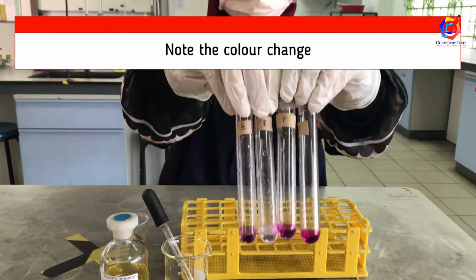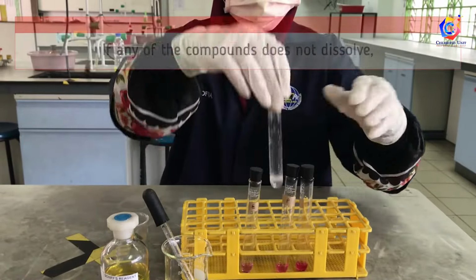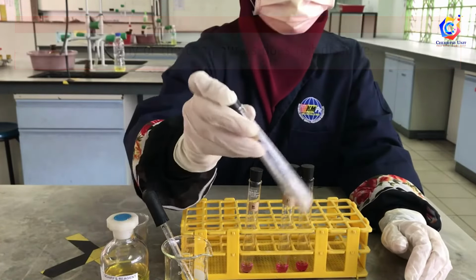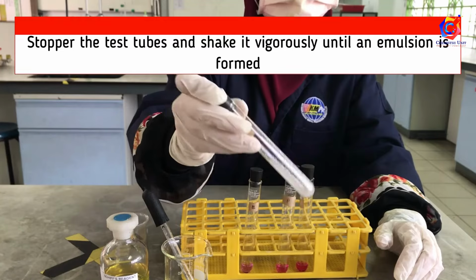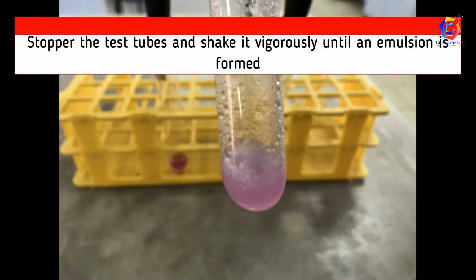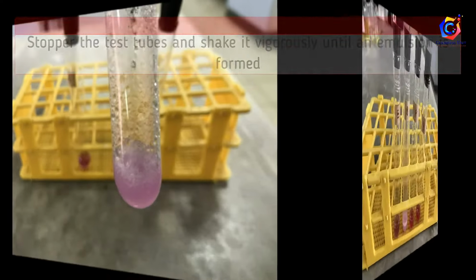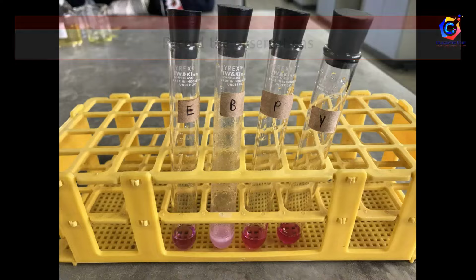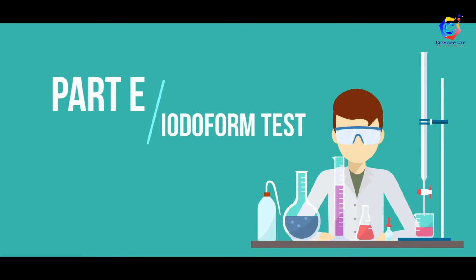Note the color change. If any of the compound does not dissolve, stopper the test tube and shake it vigorously until an emulsion is formed. Record the observations.